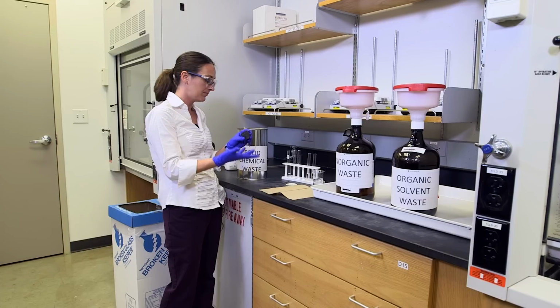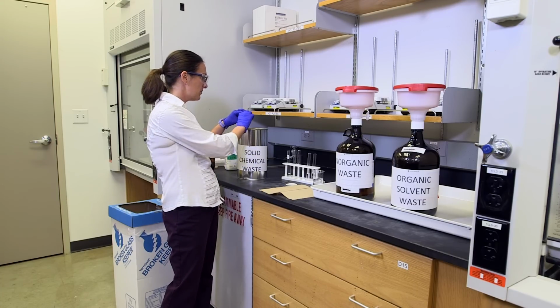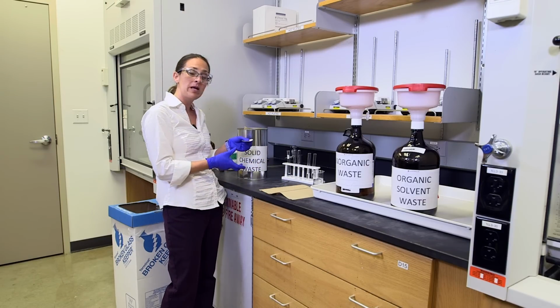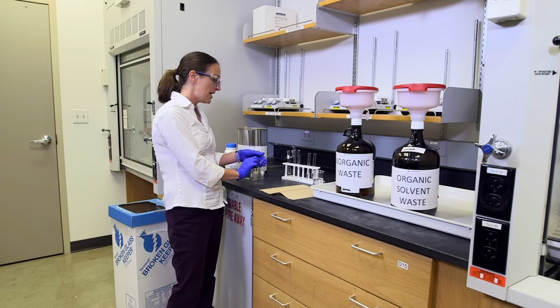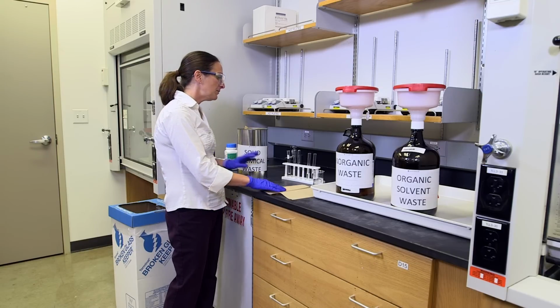Any of your magnesium oxide or something you generated during our crucible lab, that can be scraped off into our solid waste. If it's solid, then this is where it goes. Filter paper, used filter paper, still has some contamination, so we will put it in solid waste. Any unreacted magnesium ribbon we can put in solid waste.